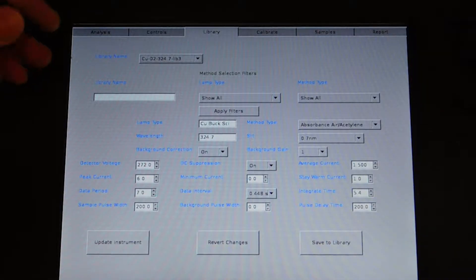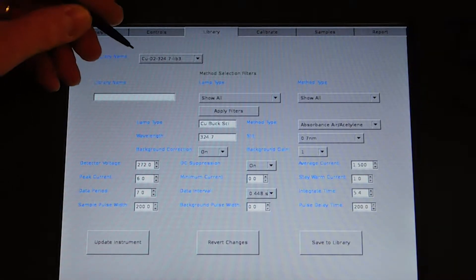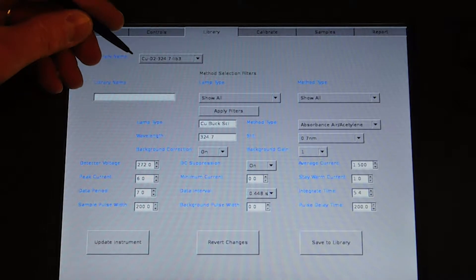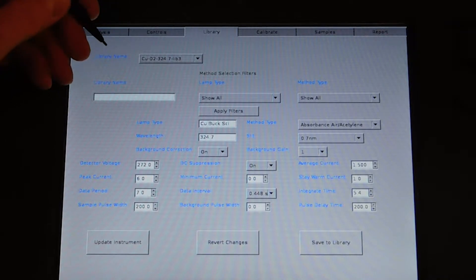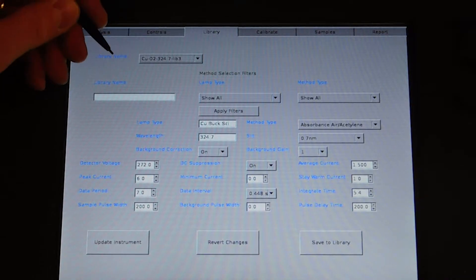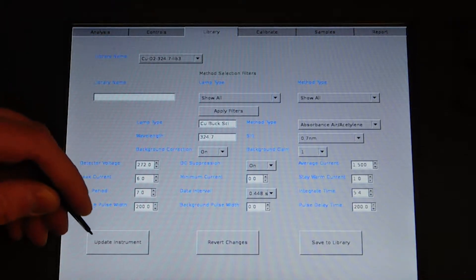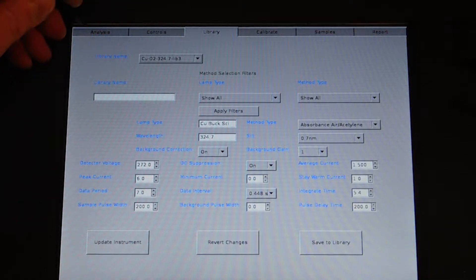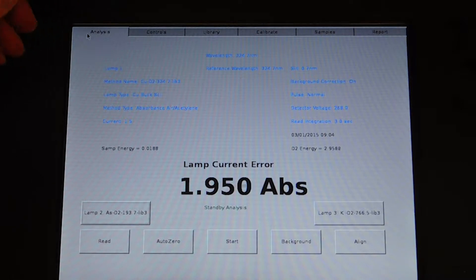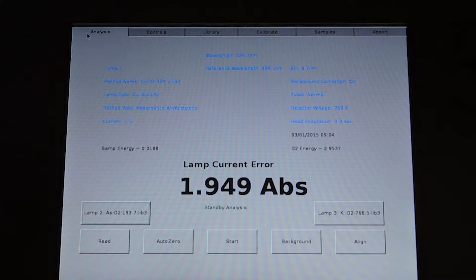After you load the library for the element you're analyzing in the library screen, you'll update the instrument and go back into the analysis screen.